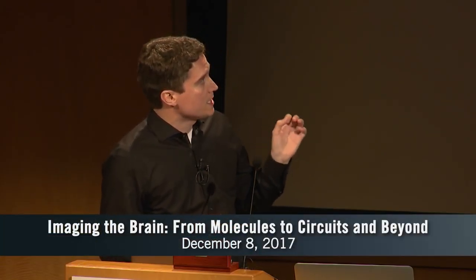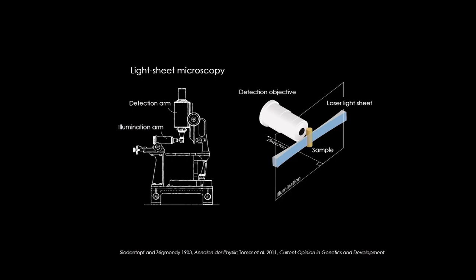But it's also a very gentle technique. It's gentle because we are only sending light exactly to the part of the sample that we're taking the image of at any point in time. We're not sending light to out-of-focus regions. We're not bleaching or damaging parts out of focus. And so this combination is really important for our work.